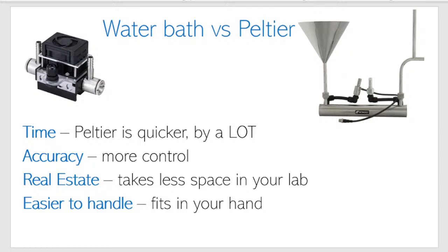So one of the benefits of using the Peltier temperature control is it saves you a lot of time. The other reason is accuracy.